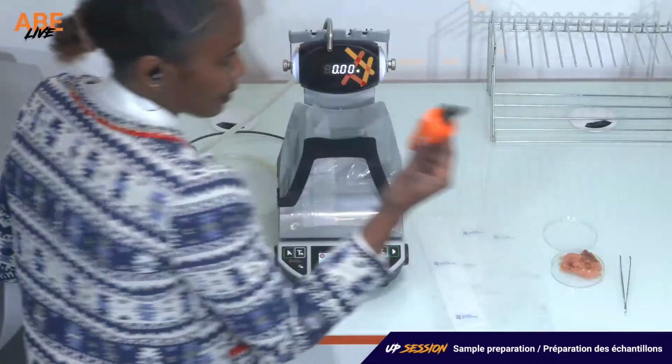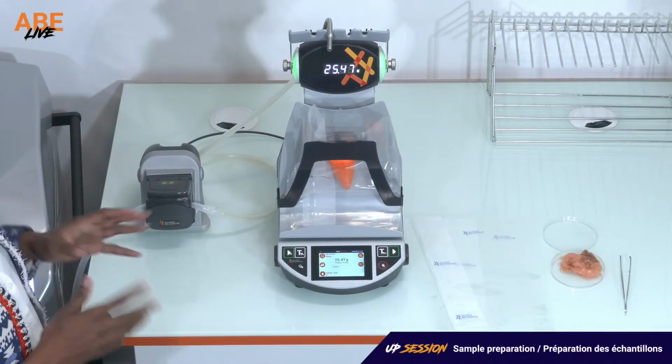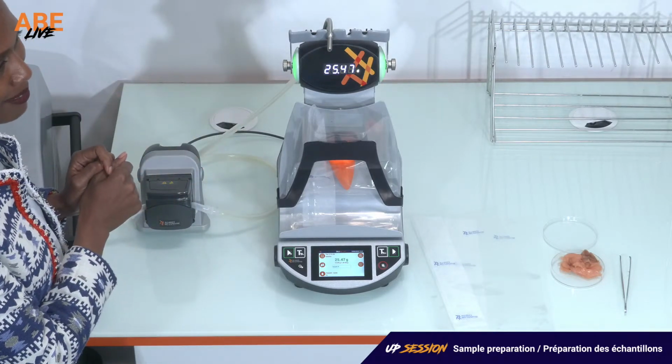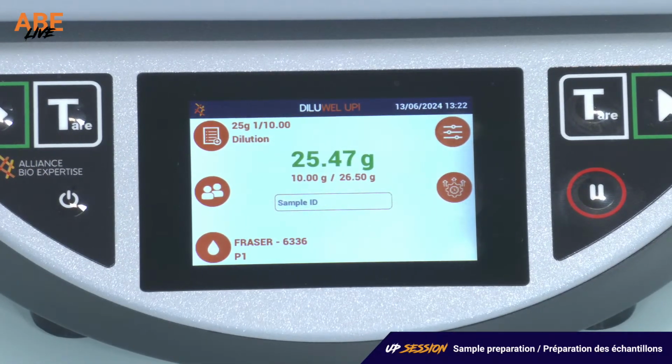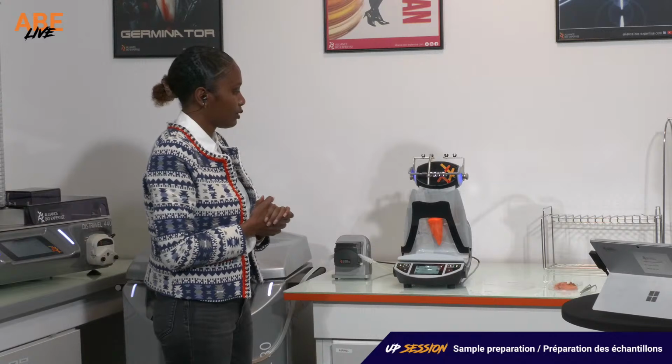I put my sample. So here it's a carrot for me. Very nice carrot. I can see the weight on the screen, but also here on the high display of the DILUWEL. Why is the DILUWEL UP turned green? It's green because, as we said earlier, in the ISO 6887 we have some tolerance in our range of the sample weight, right? And the DILUWEL is telling us if we are indeed in this range. We know we are in this range because it turned green, so we can launch our dilution. So I launch my dilution.